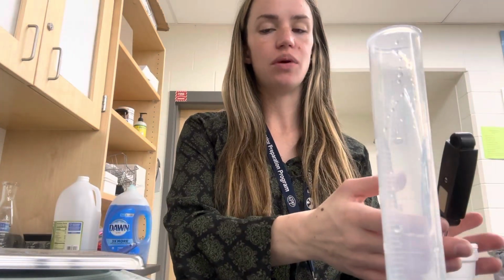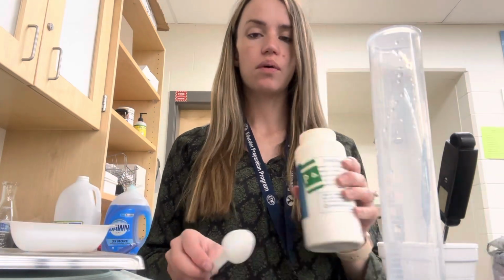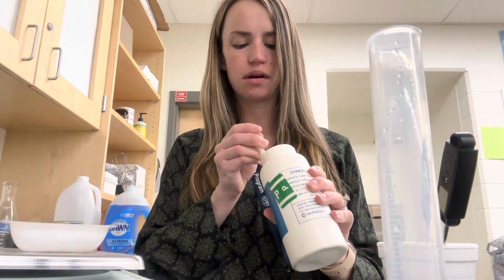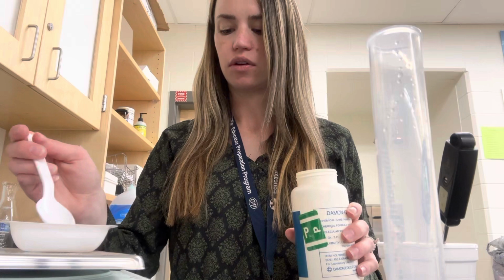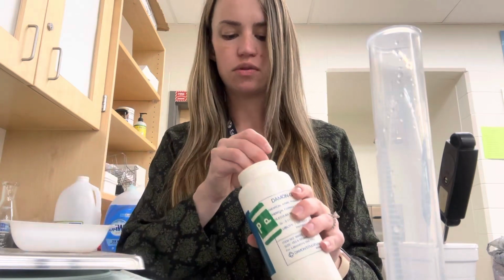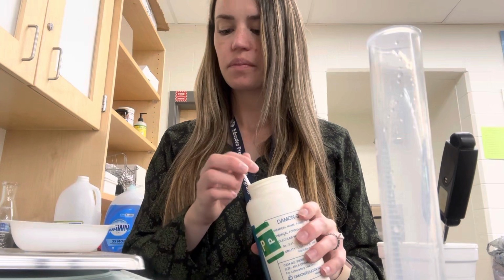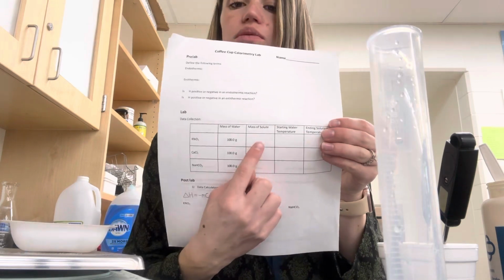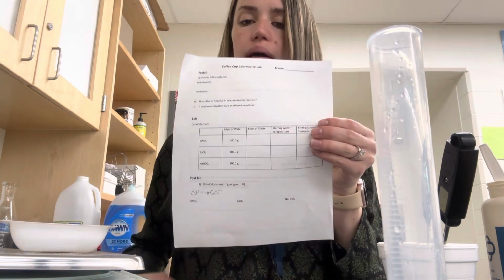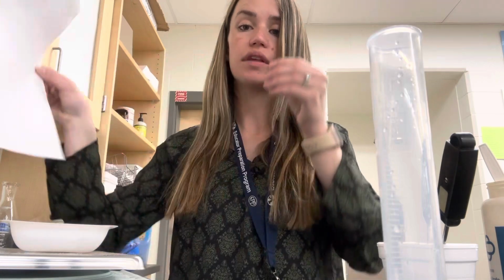While that's sitting there, I'm going to show you what you do with the next part of your reaction. So we're going to mix in a chemical. We want about 1 gram of the chemical. So what I do is I put the thing on the scale, I make sure it says 0, and then I measure out about 1 gram of the chemical. Now, we don't have to do exactly 1 gram, but whatever we put on the scale, we need to write down what that amount is on our paper. So for example, this one is 1.05 instead of just 1. So when I write on my paper, I would write that number in my mass part. So whatever number I give you on the scale is what you write here in the mass one, the second column, on your paper. So they might be 1, they might be close to 1. It just depends on whatever I exactly measure out for the test I'm going to give you.